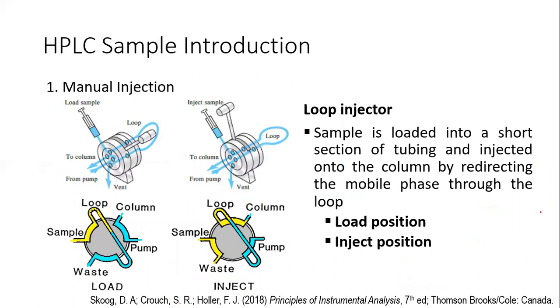So now let's look at how you introduce your sample into an HPLC. Similar to the GC, you could also introduce your sample to your HPLC system manually or automated. So may auto sampler. For the HPLC, medyo complicated ng onte yung manual injection. Okay? So in HPLC systems, you have your loop injector. So bakit merong loop injector?